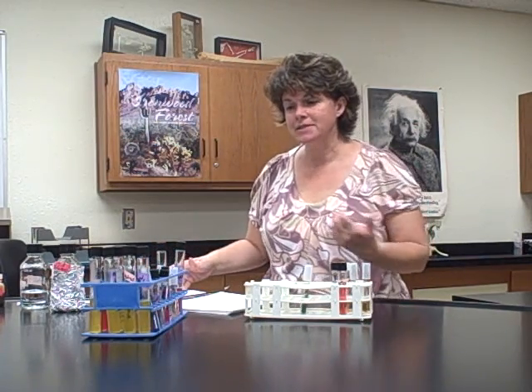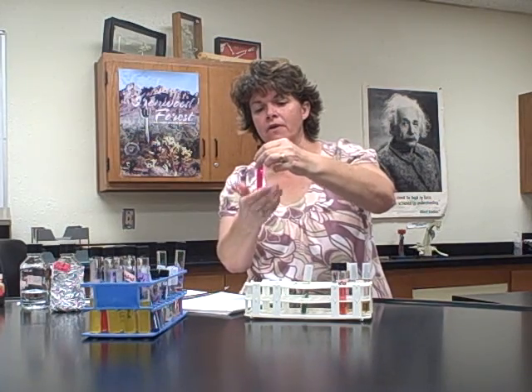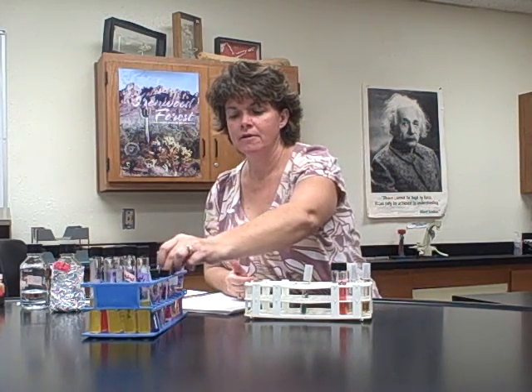Let's go back to the acid. If it turns pink, that means that it used up all of the sugar and it actually started using peptone, okay? So it's not acidic, it's actually basic. You'll get that hot pink color. Okay, now looking at gas. Now remember I told you guys to look inside the Durham tube and detect gas if there was a gas bubble the first time.